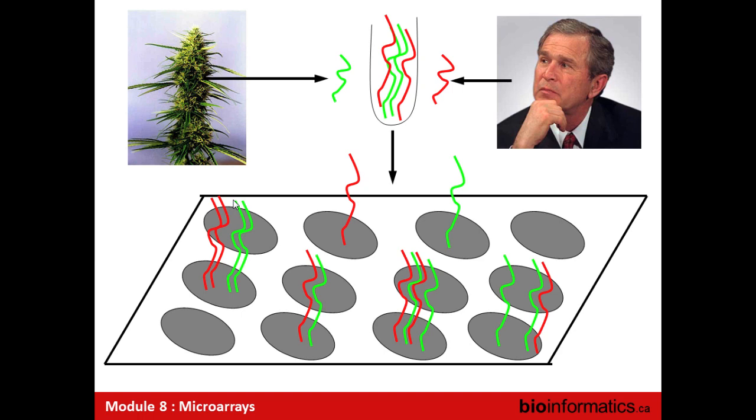So there is some of that happening, and sample gets lost, but there's still enough to give good signal. And we don't have strong reason to believe that the formation of secondary structure or self-hybridization will be biased towards some samples and not other samples. It's obviously biased towards some sequences, but what we're really looking at is, for this gene, are our results biased because of it, or is it just a uniform shift of signal? And it appears to be just a uniform shift of signal.